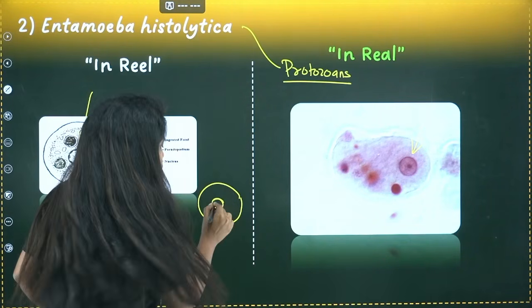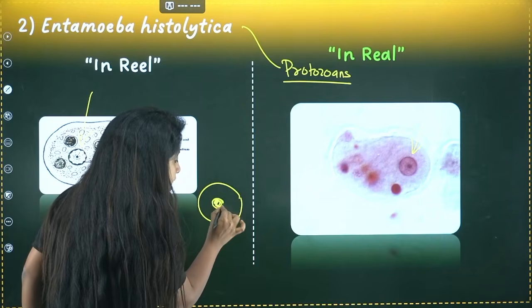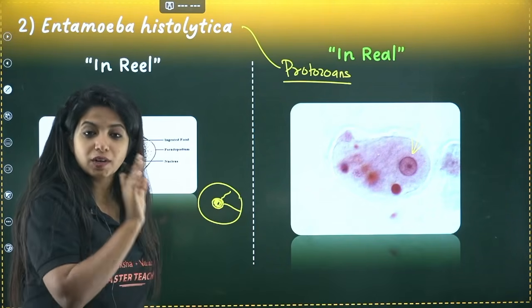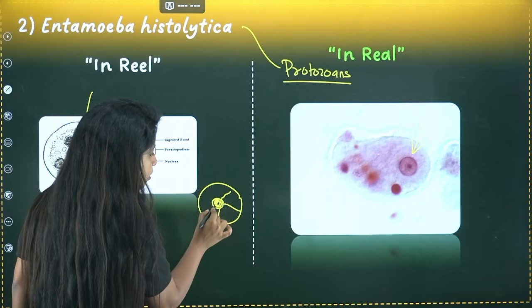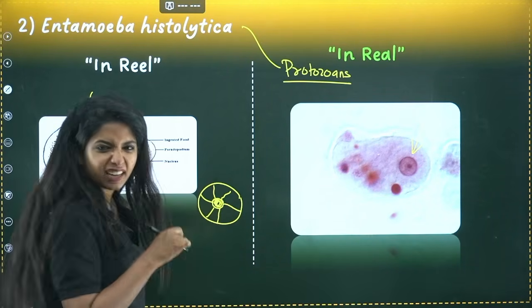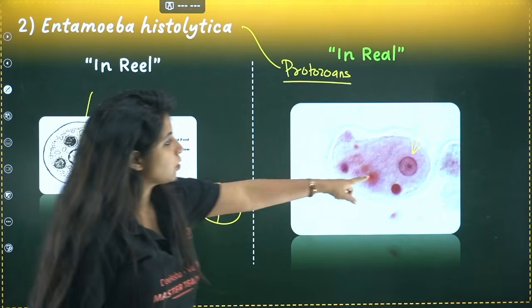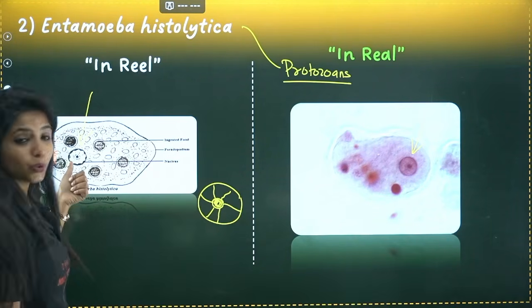Okay, it is condensed too much, which is why you find something like this. And you have nucleoprotein, as in the proteins which are found in the nucleus. They are known as nucleoprotein. They are also found in the formation of a ring. It looks like something like this, like a tire wheel or something like this. Yeah, and this is also seen over here and also here.